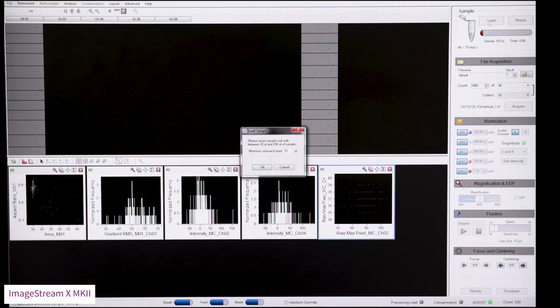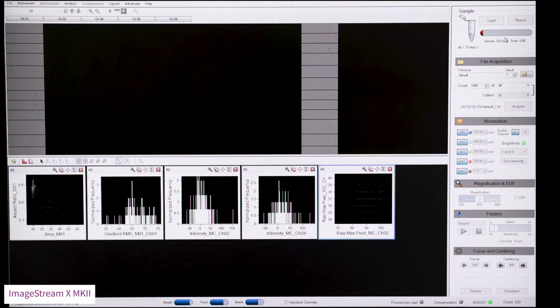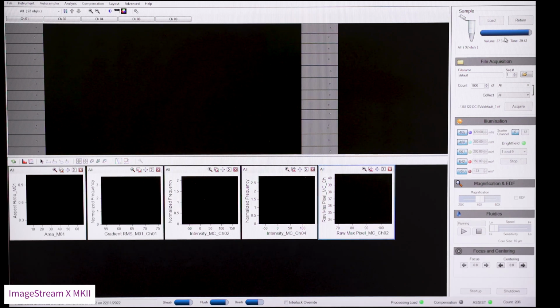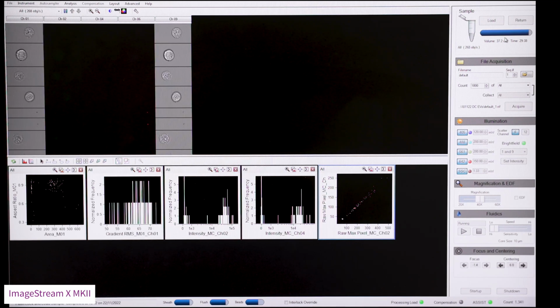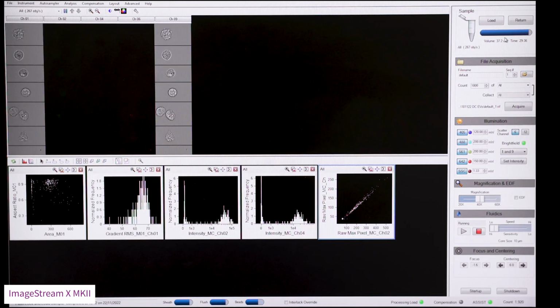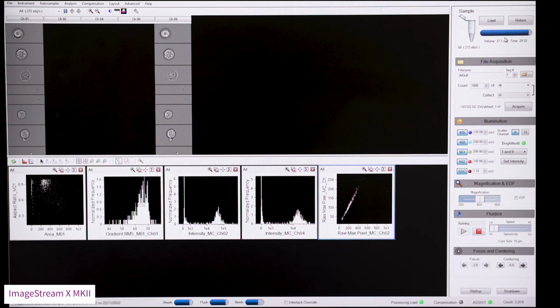On the dialog box that appears on screen, press OK. There's no need to change the value in the box. The machine will estimate the volume of the sample, which will be displayed at the top right of the software. You will begin to see cells appear on the screen. We can now continue with the setup of the machine with the sample running.